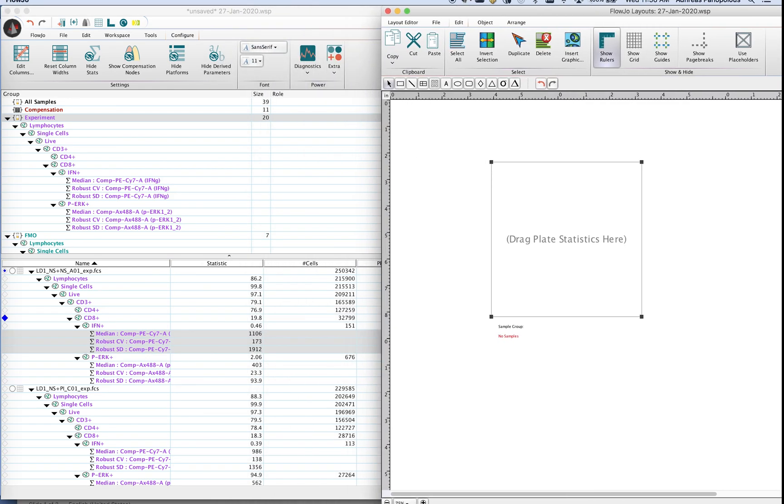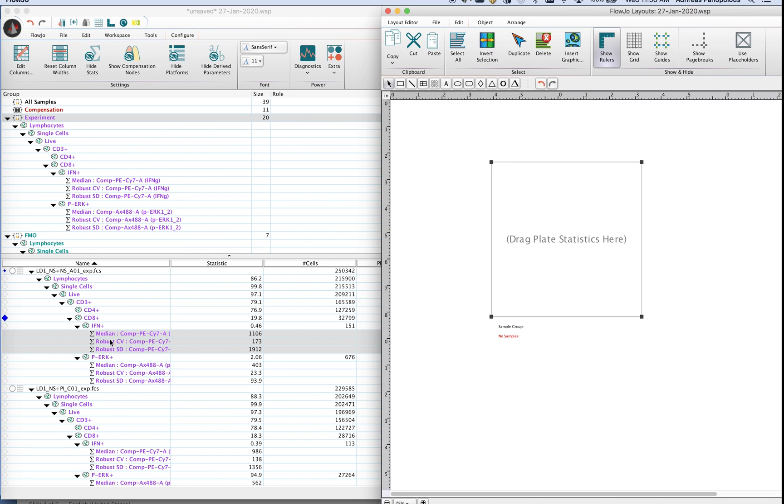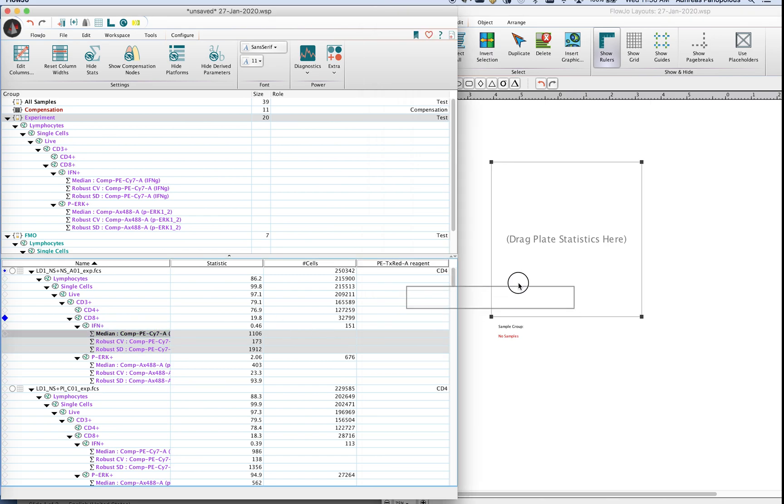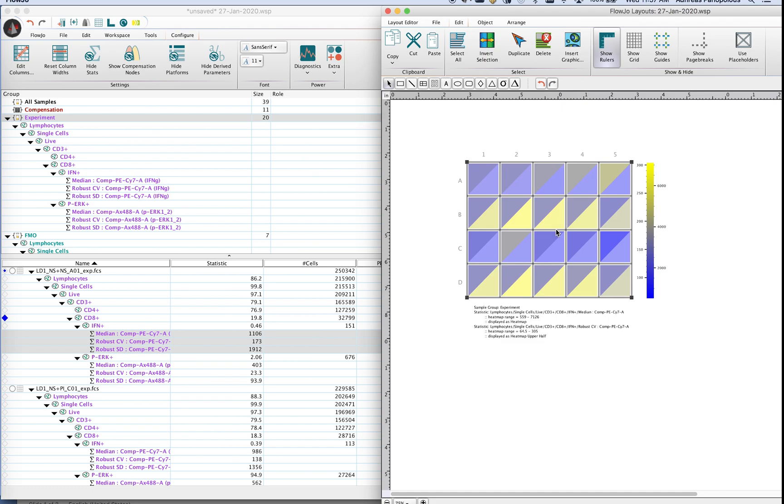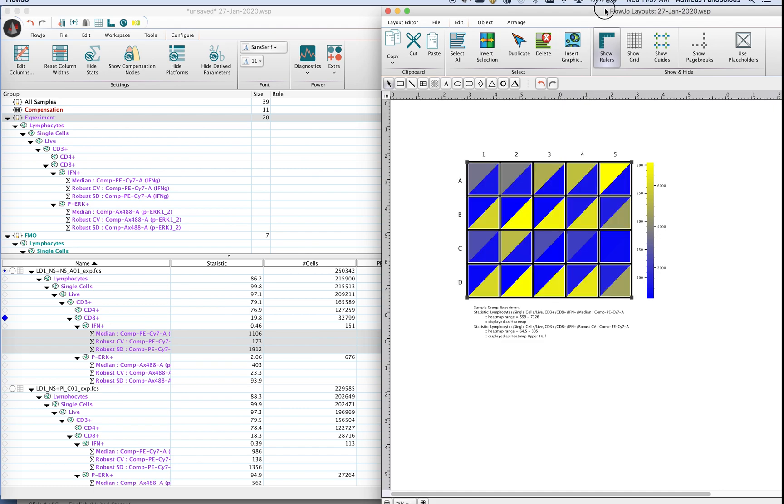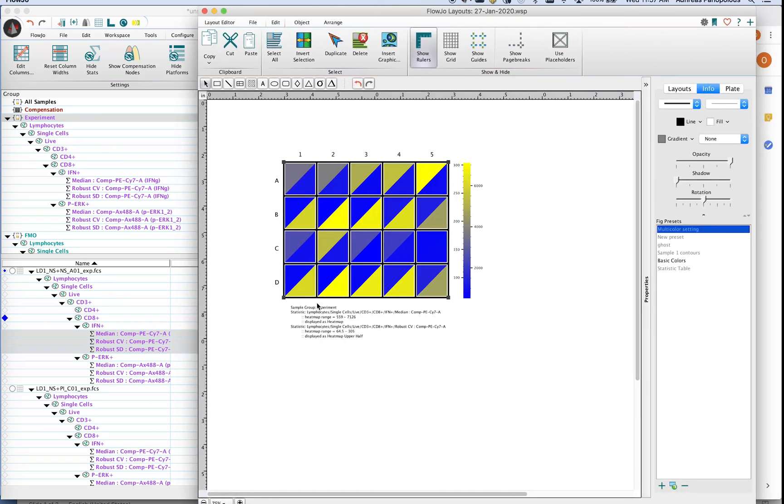So if you'd like you can go ahead and drag the gambit of statistics that you have directly into that plate and it'll give you a split heat map in this case. But as you noticed I dragged in three statistics and what is being displayed here are only two.